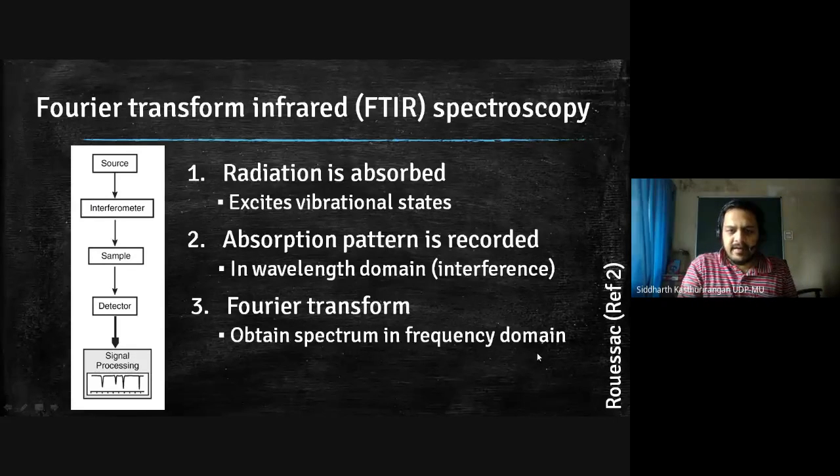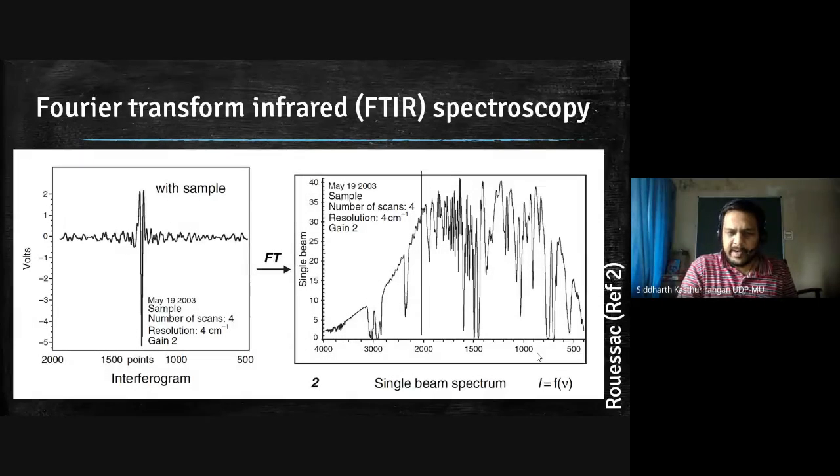Let me show you an example which will not clear up things completely, but at least give you an idea what I mean. I hope you can see that this sample which is there on the left, the signal, is having some kind of oscillatory behavior, and then it has a large oscillation somewhere here, and then again it has an oscillatory behavior. This particular signal is called an interferogram. It is basically the signal coming out from a Michelson interferometer kind of experiment.